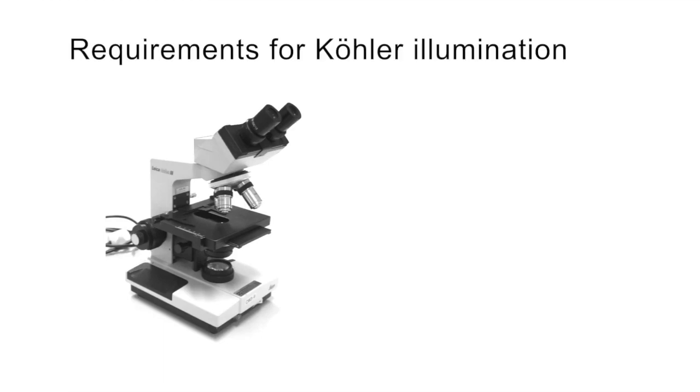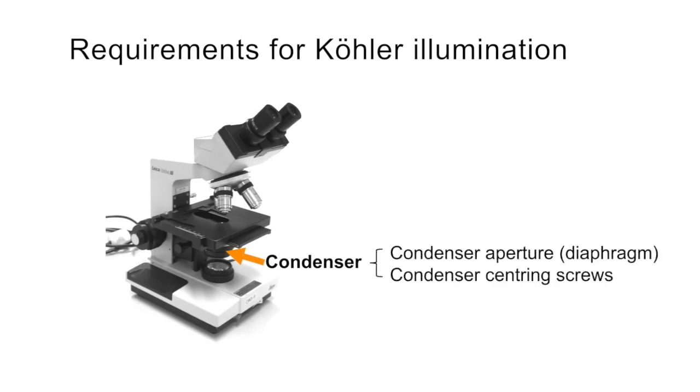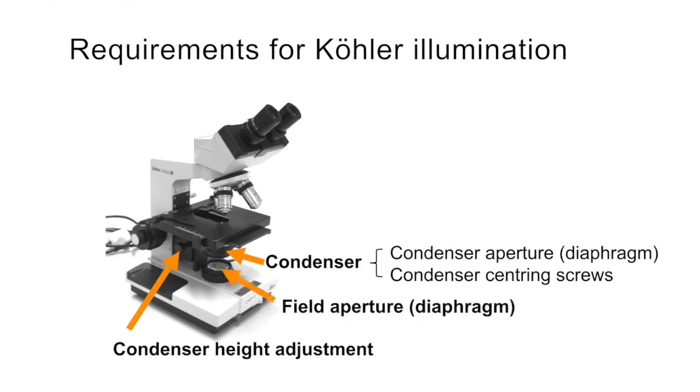So what do we need to ensure this is set up correctly? We need a condenser, and ideally we should have control over the aperture and the centering using centering screws, as well as being able to adjust the height. It's also ideal to be able to adjust the field aperture, but if that's not possible, we can get pretty close using either a sharp pen or a pencil.